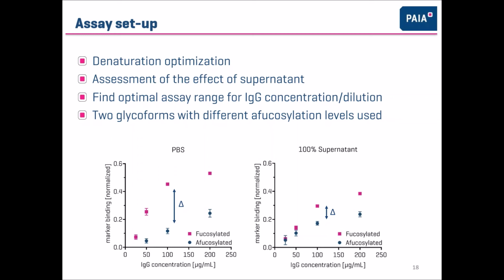I was trying to see how we could push down the sensitivity below 50 microgram per mil for platforms that are static in early stages of cell line development. Static, of course. You will have a problem with sensitivity, yeah.